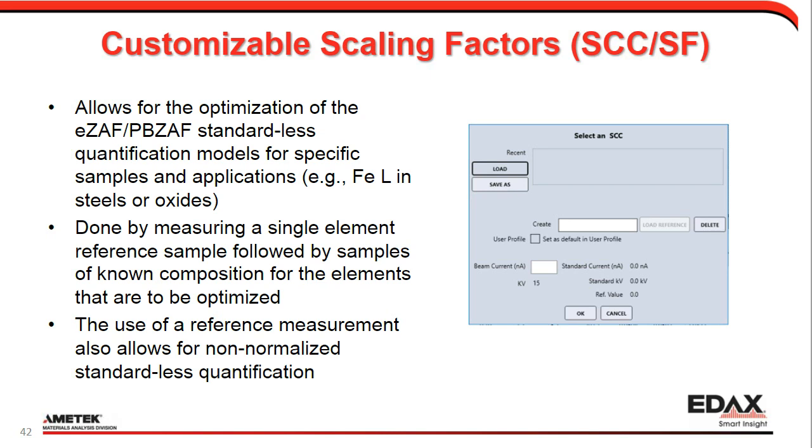To summarize the benefit of SCC and SF factors, first of all, it optimizes the calculation in the model to get the right results for specific samples and applications. And secondly, you can do non-normalized quant without standards.